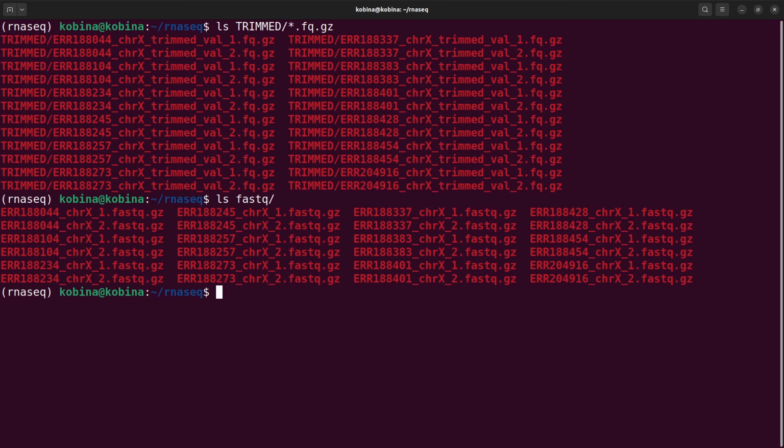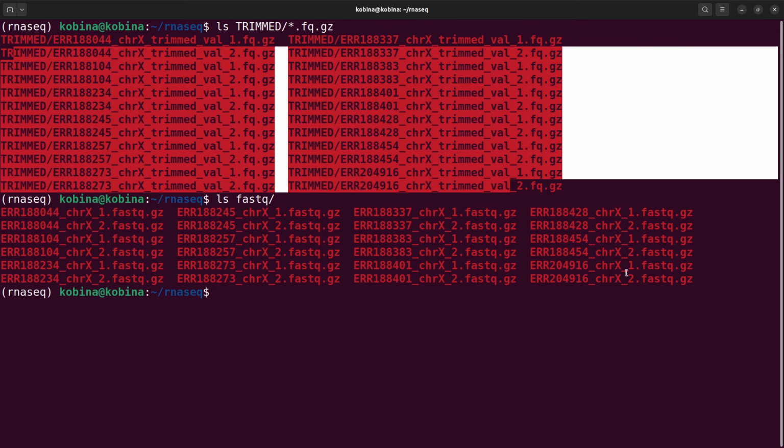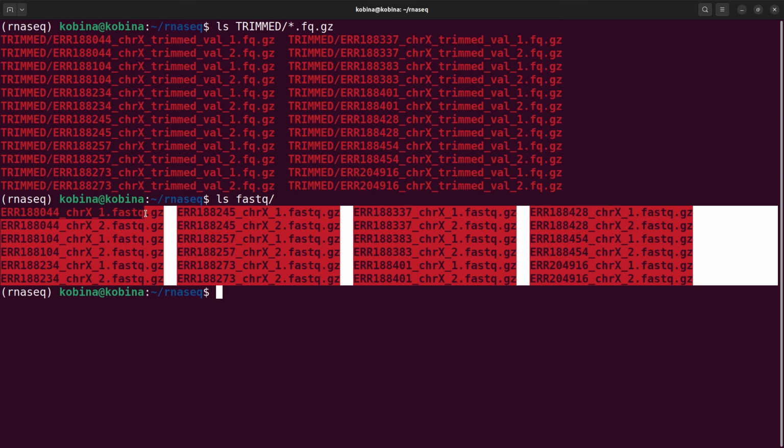So if we want to run QC, what I want to do is to first aggregate all the files, both trim reads and then the raw reads. I'll aggregate all of them together and I'll run fastqc as well as multiqc on them. Okay, so that is what I'm going to do next. So just take notes of that. So let's do that now.